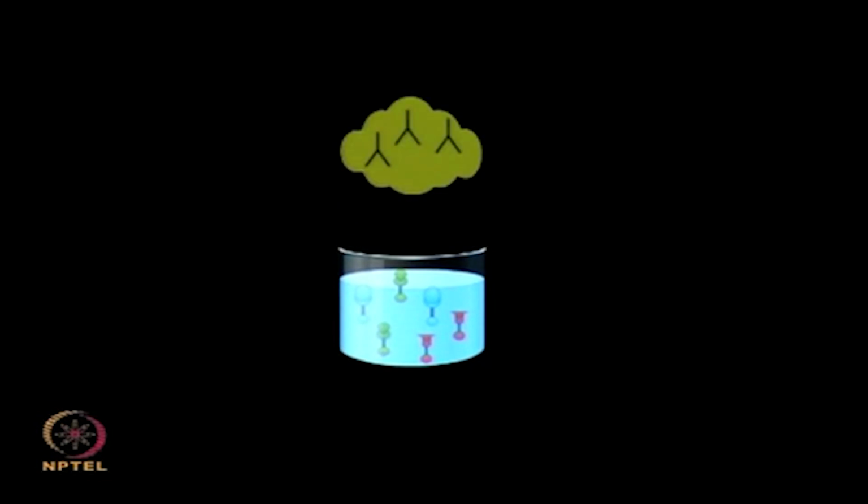After mixing the beads together, the serum was added to these coupled beads and human IgG was detected by probing with the enzyme linked anti-human IgG.